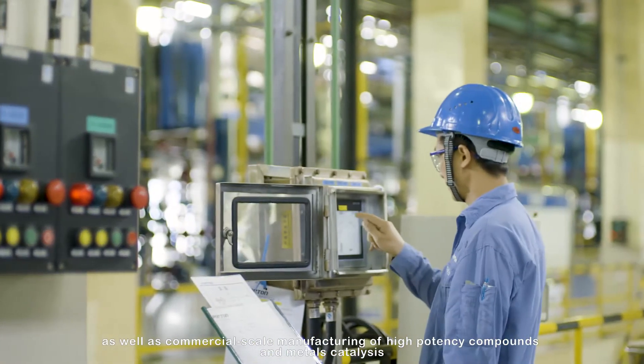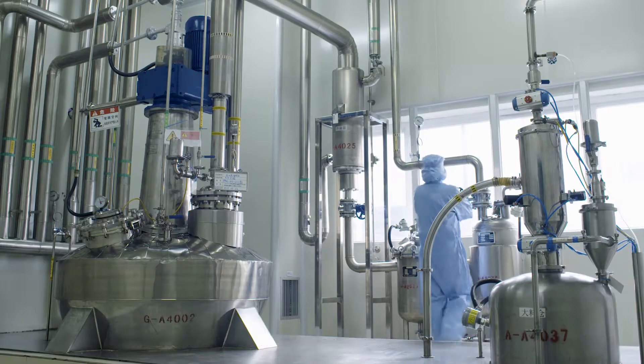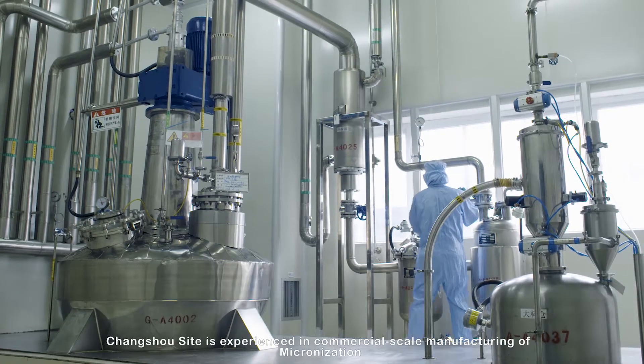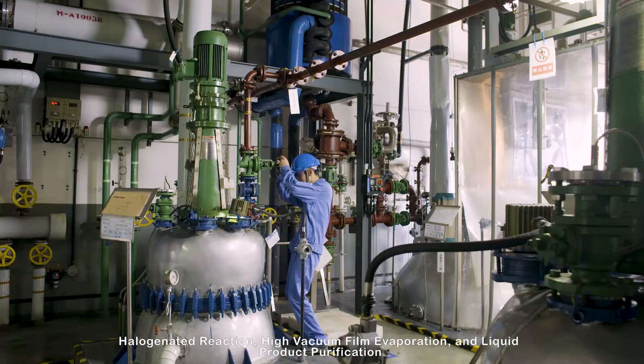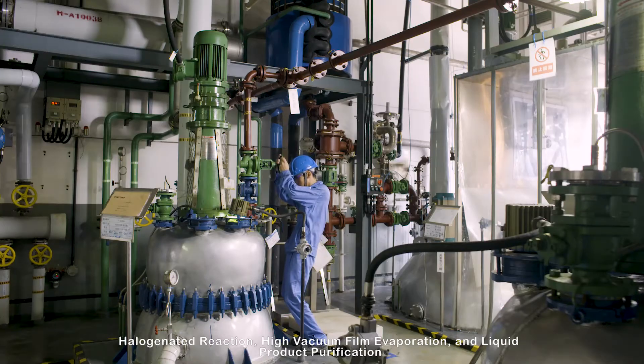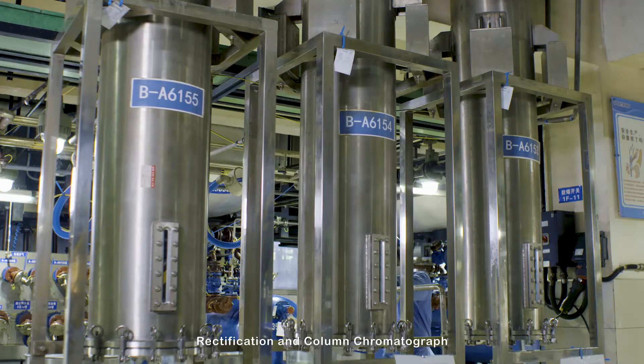As well as commercial-scale manufacturing of high-potency compounds and metals catalysis, Changshou site is experienced in commercial-scale manufacturing of micronization, halogenated reaction, high vacuum film evaporation, and liquid product purification, rectification and column chromatography.